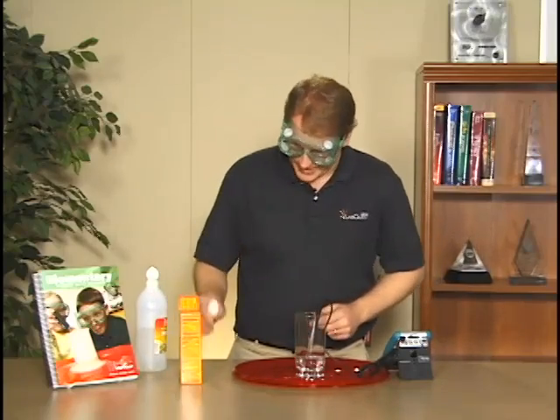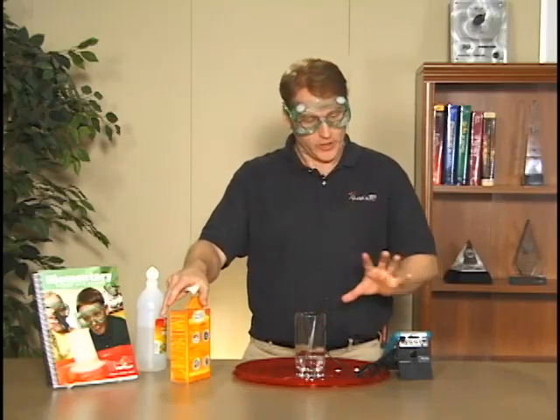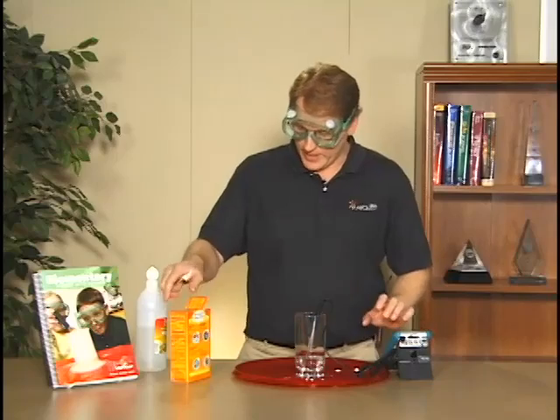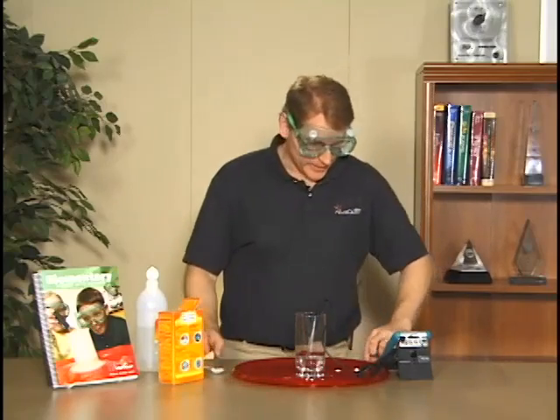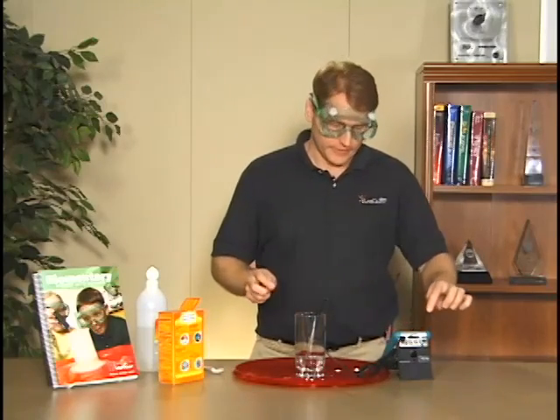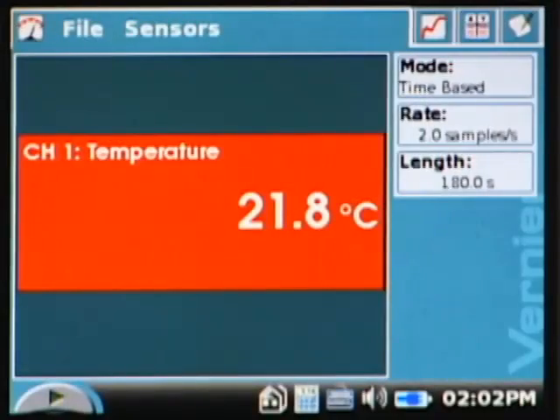What I'm going to do is start the data collection first before we add the baking soda. When you plug in the temperature sensor to the lab quest, it auto-IDs the sensor, and right now it defaults to being 180 seconds for our time and two samples per second.